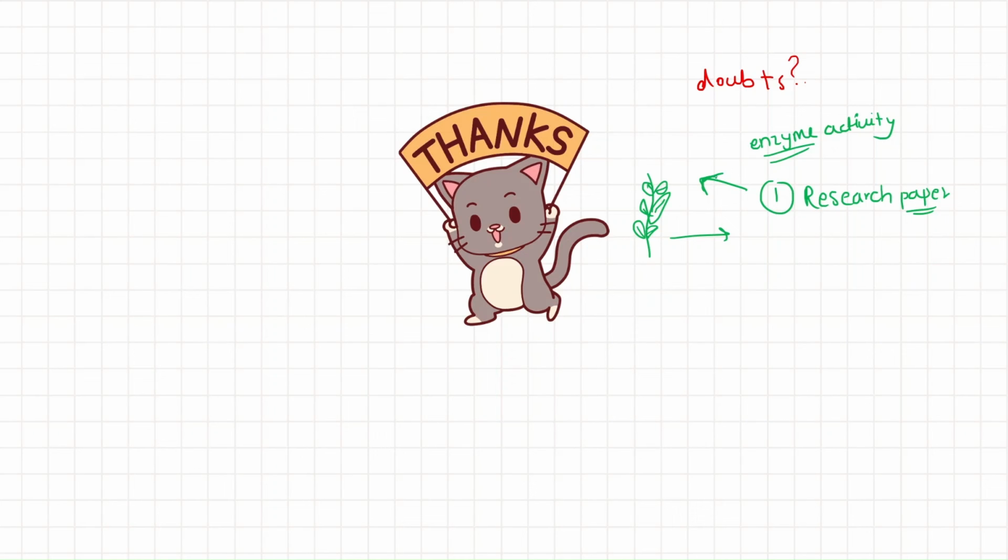Many times a single method cannot be employed for different plants. For example, one plant may give different results if you use a buffer of different pH, and if you alter the pH, it is going to show a different result.